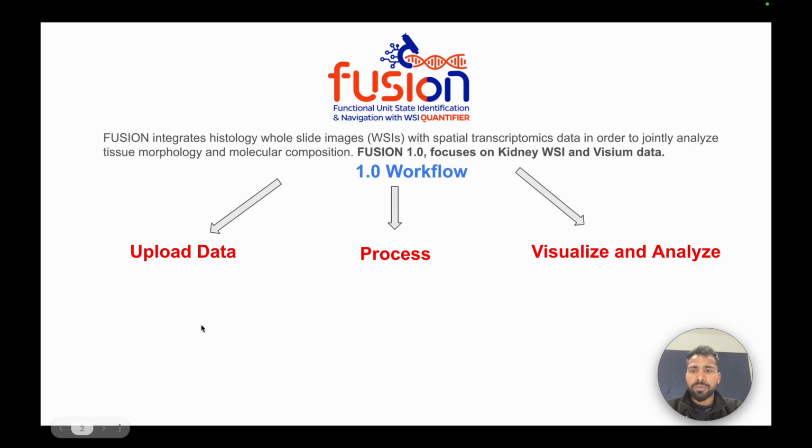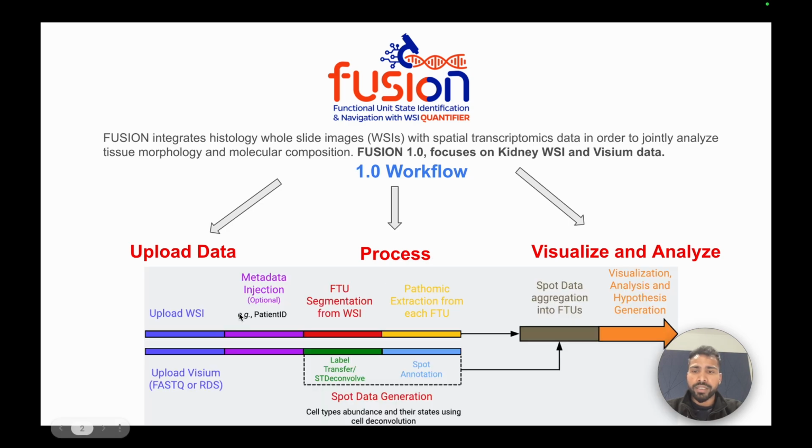So now that you have seen a high-level workflow of Fusion, which includes upload, process, and visualize, let's break it down into a clear step-by-step pipeline, starting from upload to doing integrated analysis.